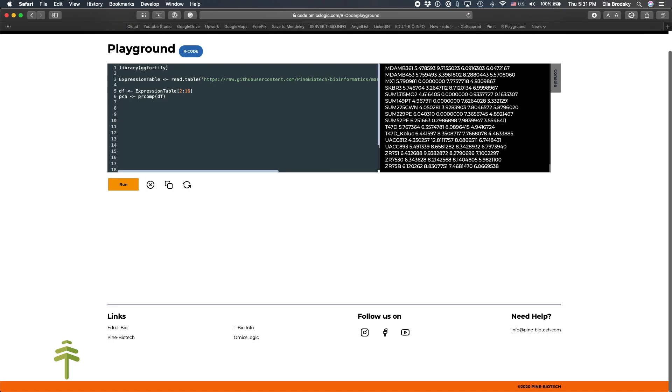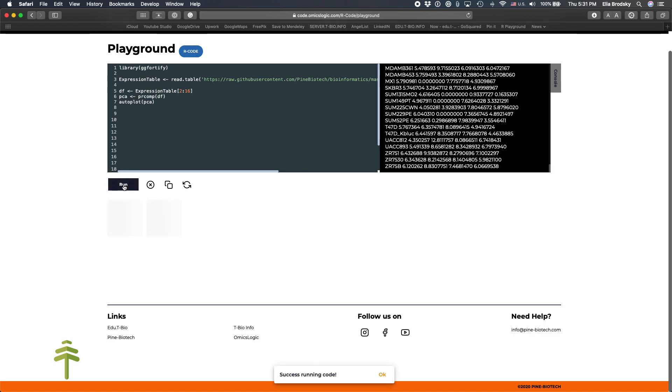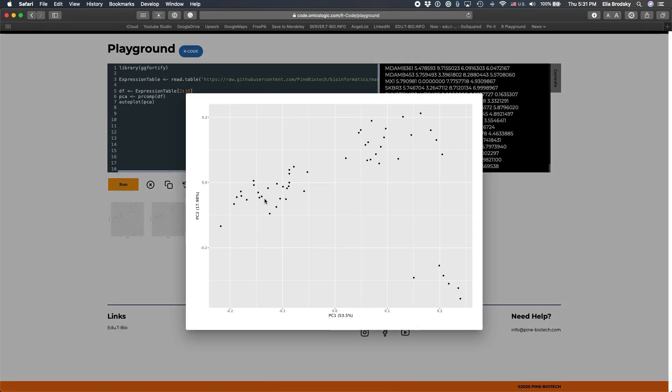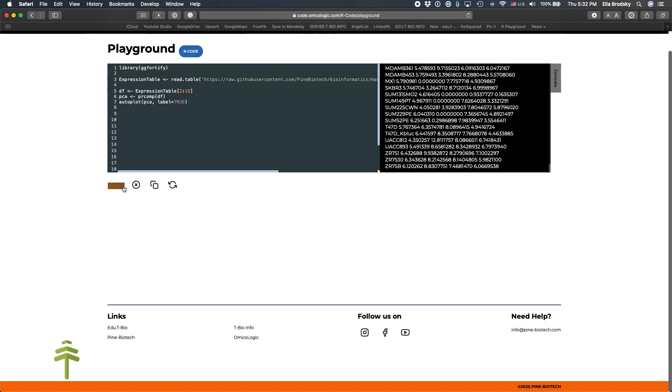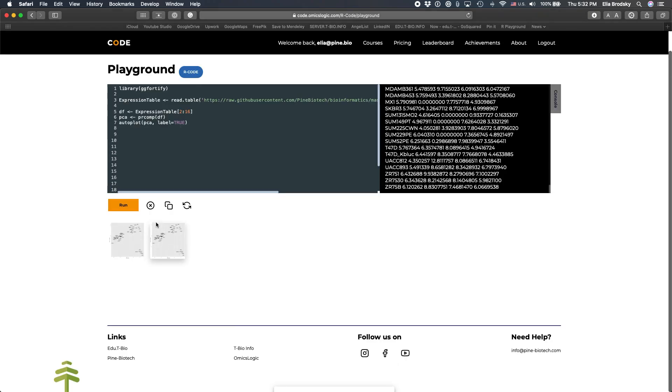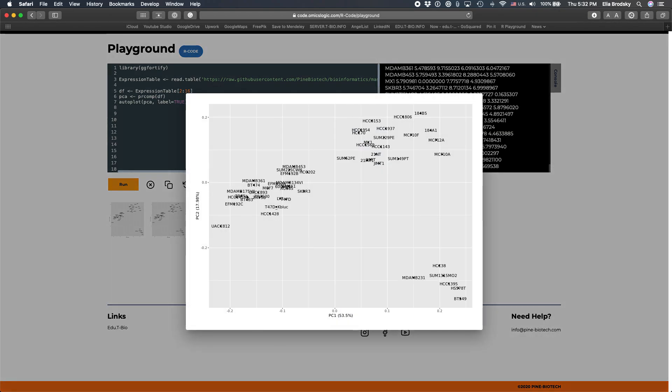And now we can visualize it. So autoplot PCA. Let's see what happens. Okay, so just like last time, we see here some of the samples, but we don't know which ones they are. Of course, we can label them. So if we just add label equals true. We'll see that whatever is stored in our row names, which are the sample names, is going to be displayed.